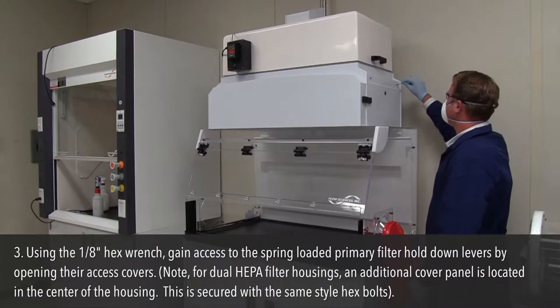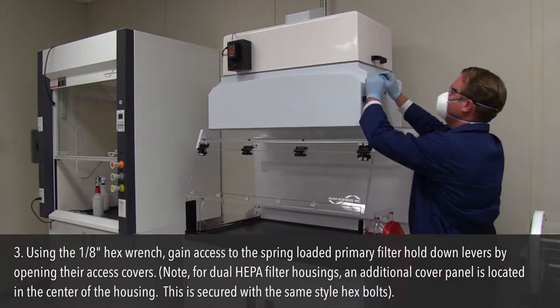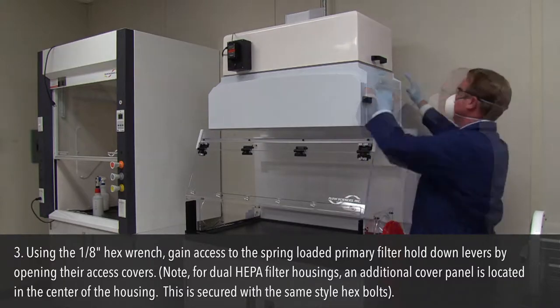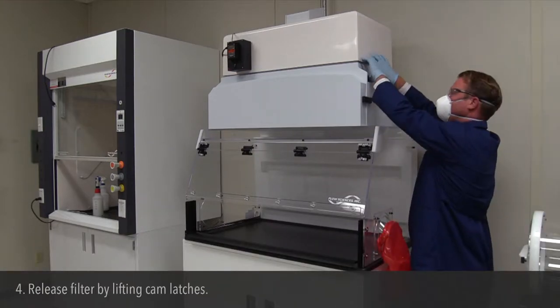Step 3: Using the 1/8 inch hex wrench, gain access to the spring-loaded primary filter hold-down levers by opening their access covers. Note: for dual HEPA filter housings, an additional cover panel is located in the center of the housing, secured by the same style hex bolts.